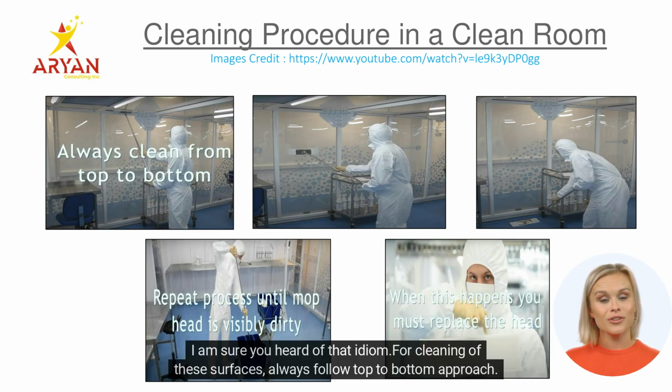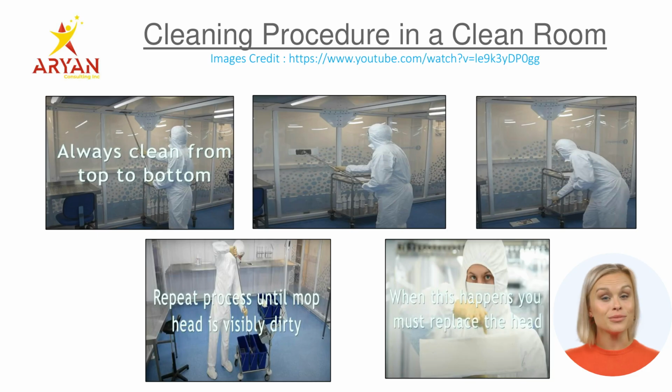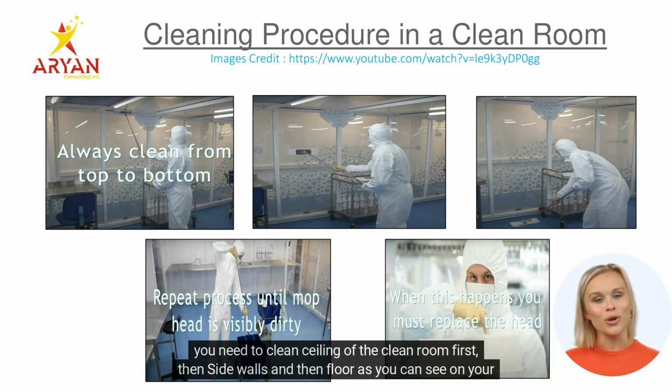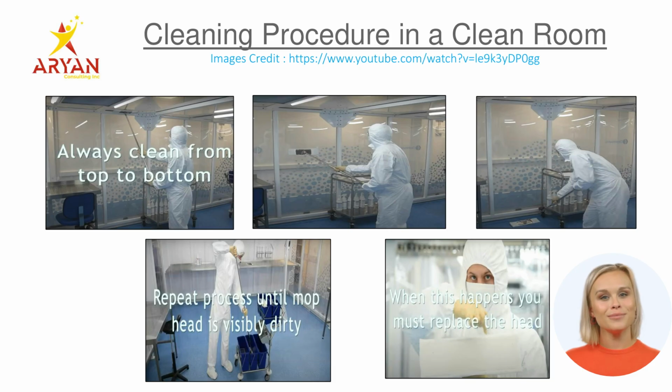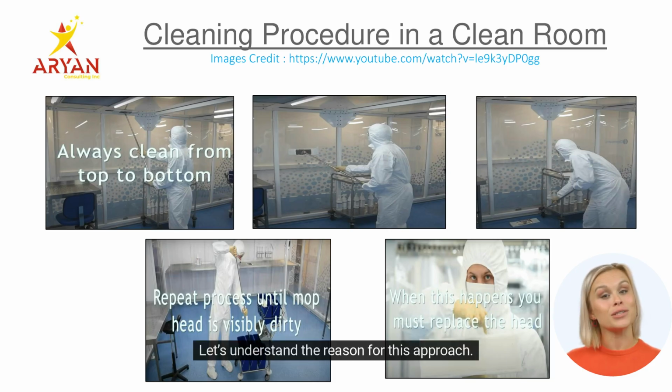For cleaning of these surfaces, always follow a top to bottom approach. Remember, you need to clean the ceiling of the clean room first, then the side walls, and then the floor, as you can see on your screen in pictures number 1, 2, and 3. Let's understand the reason for this approach.